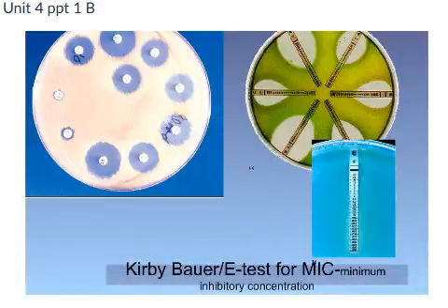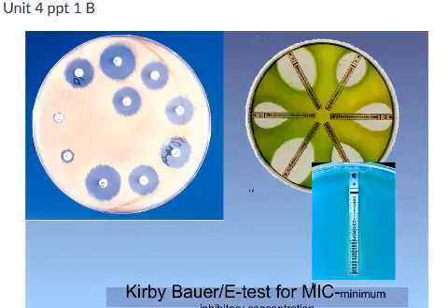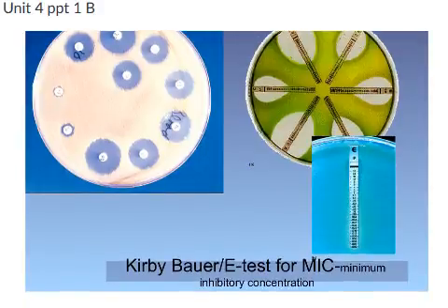Okay, so for Unit 4, PowerPoint 1, Part B, we're going to switch gears a tiny bit. And we've talked about some of these things before, but this is kind of the lab experiment that goes along with which drugs to give a patient and how much or how little. So there are two different tests in the lab. We would have done the Kirby-Bauer, and we'll do some rendition of it in the weeks to come.